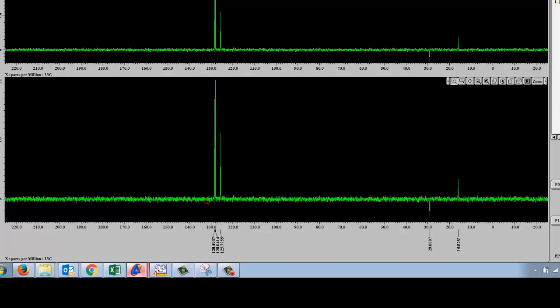However, on the opposite end, in the DEPT spectra, if your sample is too concentrated, sometimes the NMR software isn't able to actually phase or accurately process your information, and you may actually see peaks that go in the opposite direction from where they should on the DEPT. On the carbon, that's not an issue, but on the DEPT spectra, that is. And sometimes when your sample is way too concentrated, we sometimes see that.